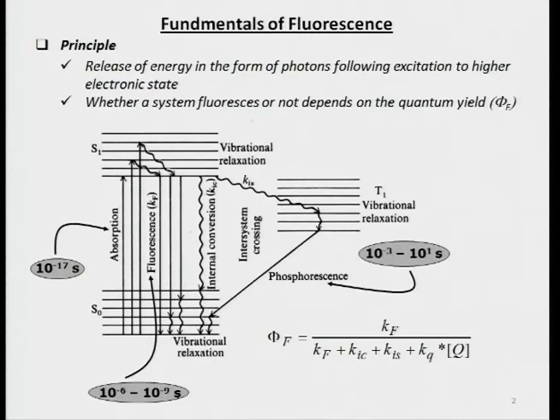In addition to the general loss of thermal energy and the release of energy in terms of photons, if there is a state called triplet, which is possible for some molecules, you might actually transform a singlet state into a triplet state through vibrational changes and change in electronic structure. And then that could release energy.